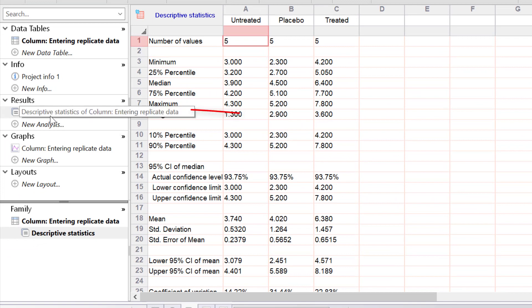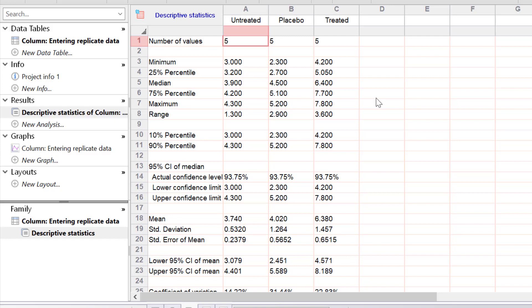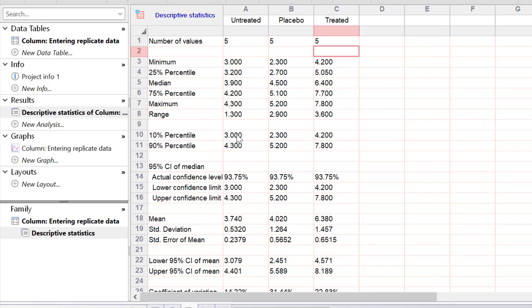A new result sheet has been created called Descriptive Statistics. The data is returned in different columns, each representing a different group. First we have the number of values — the n number for each group — with five data points in each group. There's the minimum, maximum, and range. Then the 25th percentile, the median, and the 75th percentile — all of this data would be used if you chose to display a box plot, for example. We also selected our own percentiles: the 10th and the 90th percentile.